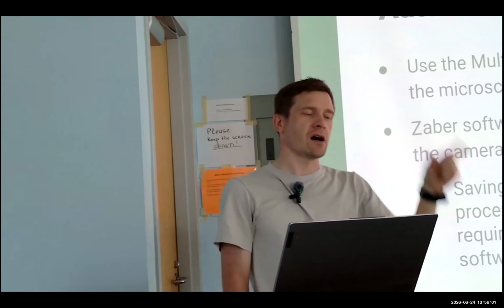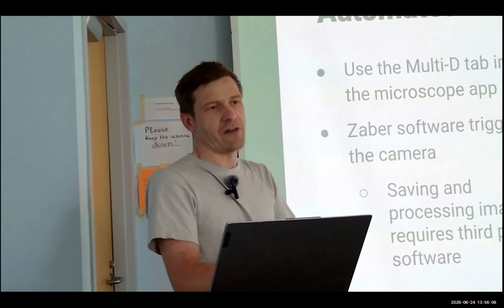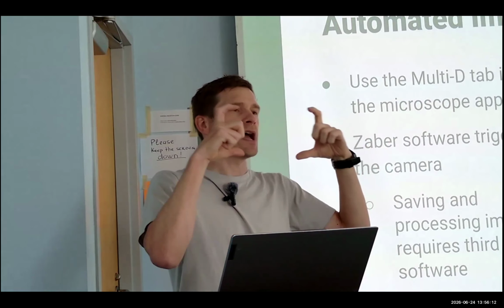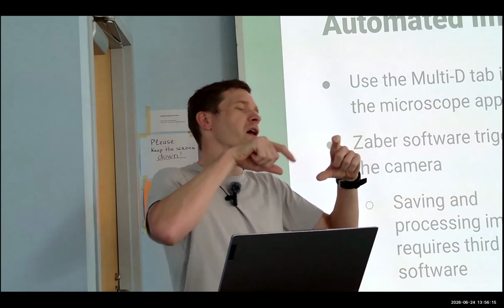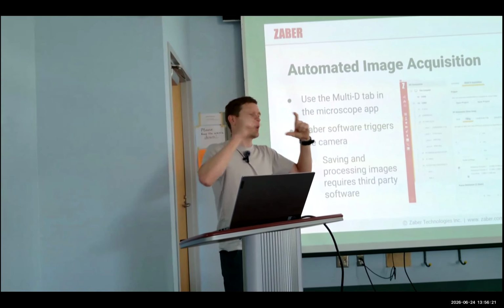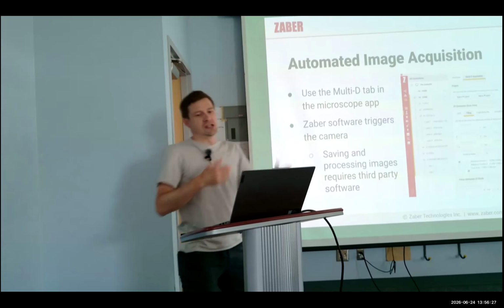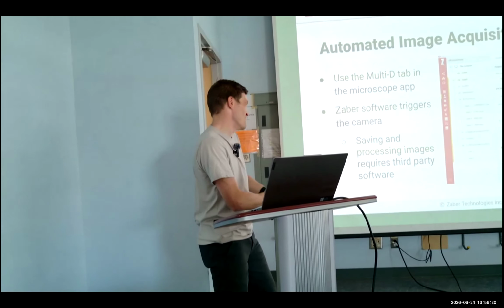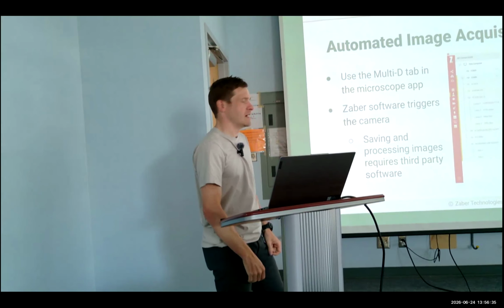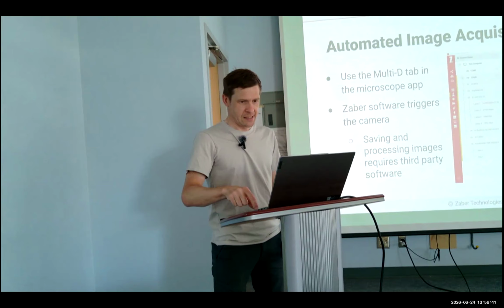You can do some really cool stuff using the generative AI platform of your choice. Like, I've fed images or CAD models of samples in and told it, here's what I'm trying to do. Here's the dimensions of this in millimeters. Give me a position file, or CSV file, that has the positions to do this, and it's worked. So if you're doing some kind of interesting non-standard sample, custom consumables, that's an actual good use for those tools.